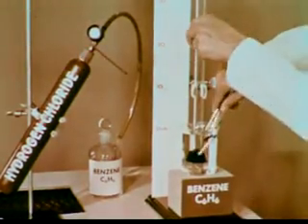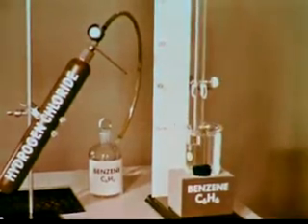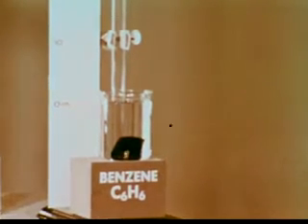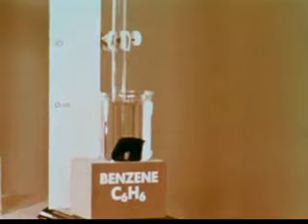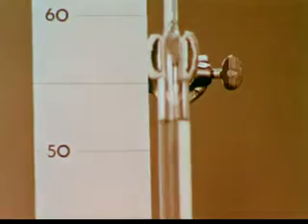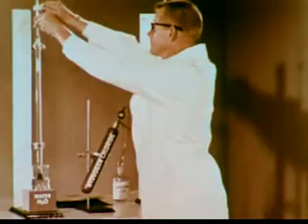Now let's try HCl and benzene. Quite a contrast. Careful observation is needed to see that the benzene level actually is rising. Here is the level about 5 minutes later. And here about 15 minutes later. Let's drain out the two solutions and compare some of their properties.